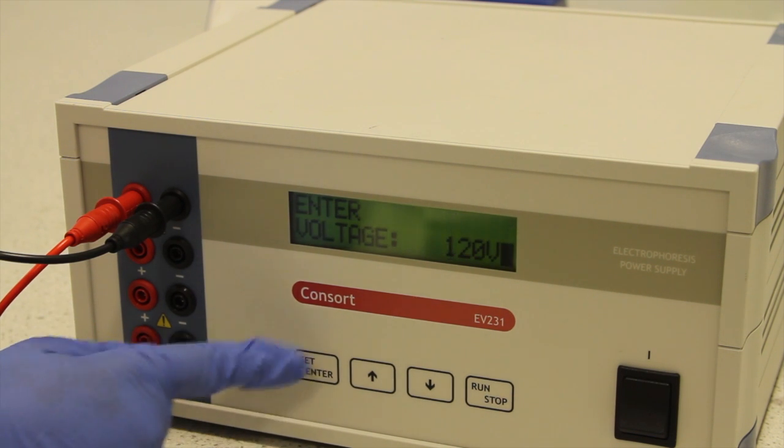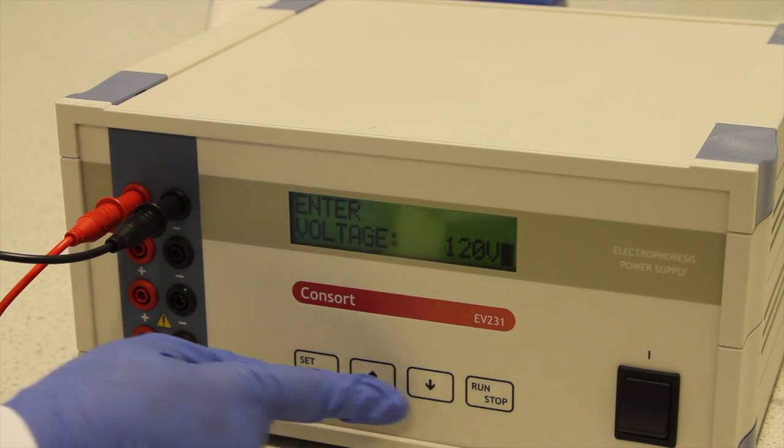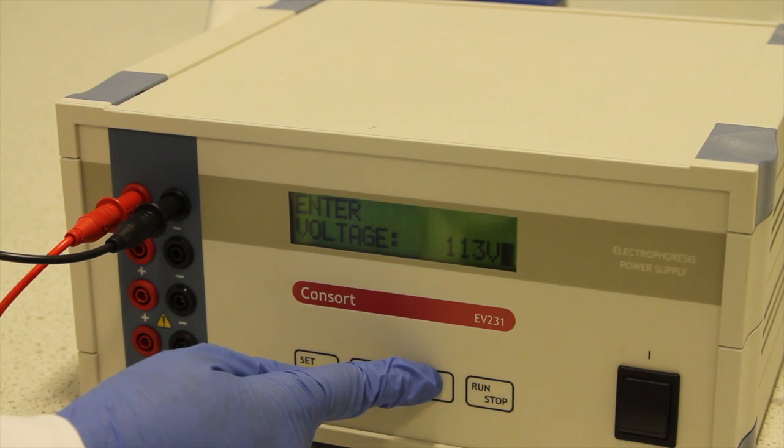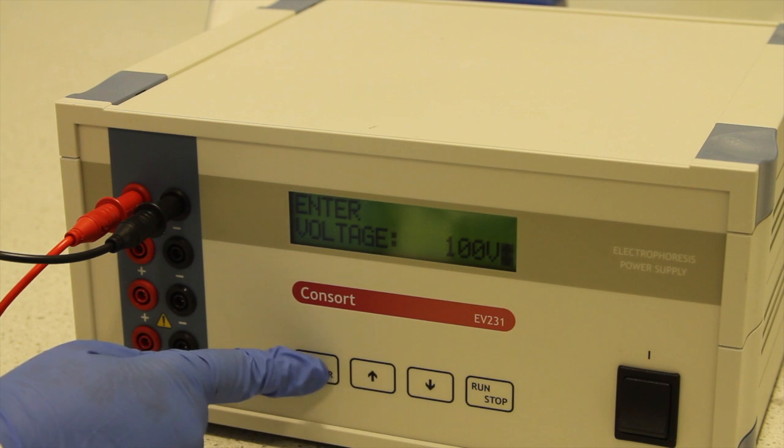Turn on the power pack. Press set until the display shows enter voltage. Use the up or down arrow to set the voltage required, in this case 100 volts. Press run.